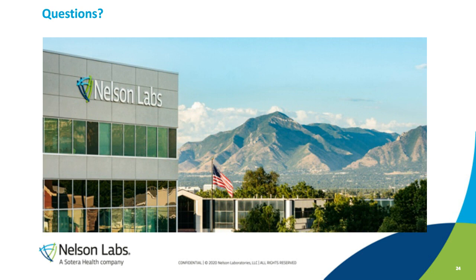Okay, good. Question from Ryan. When the FDA asks for 5 standards by LCMS, do they really mean they want 5 for each of the positive and negative LCMS? This seems excessive.